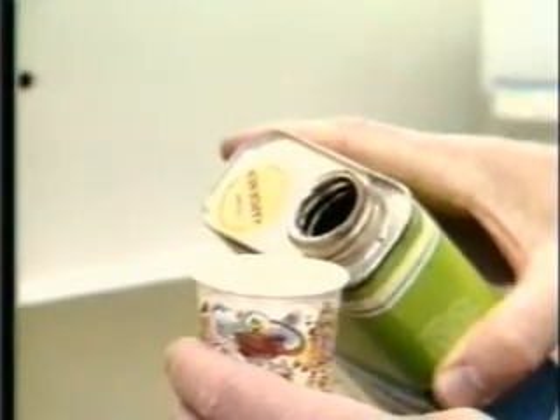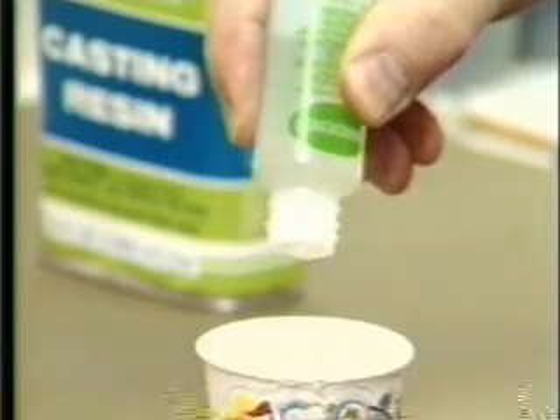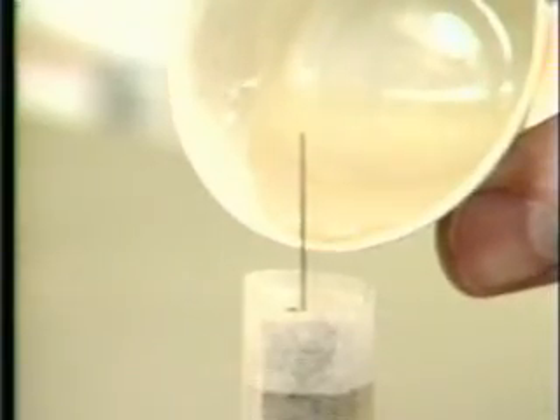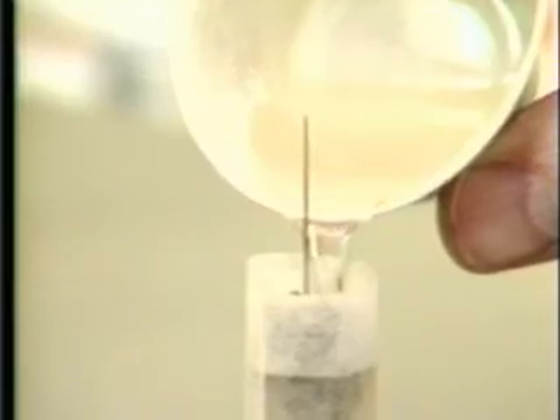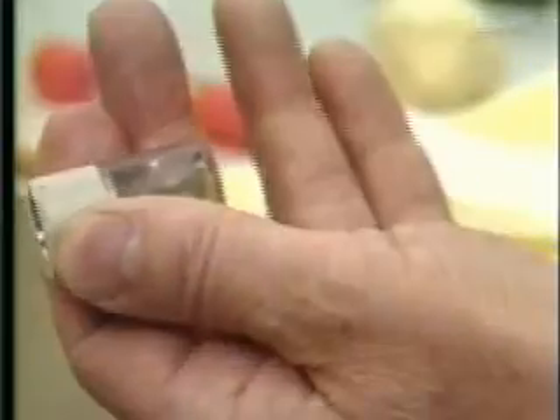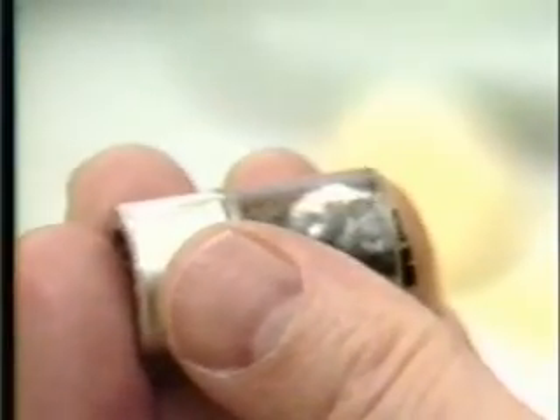Now mix the casting resin with catalyst according to directions on the container. If stirring creates bubbles, let them rise and disappear before pouring the mold. As the resin cures, it will first gel. When it is firm enough to hold its shape, remove the needle, the tape, and the specimen. Also remove excess resin, especially around the aluminum base.